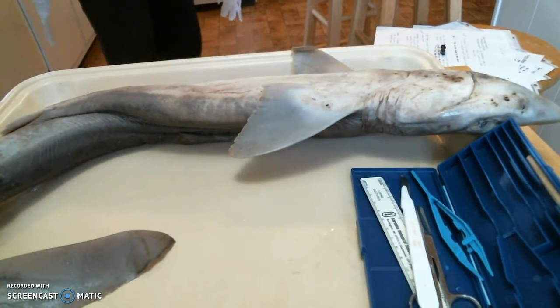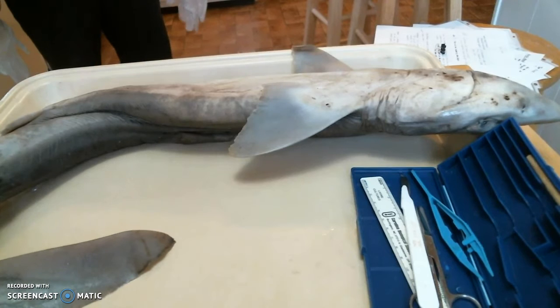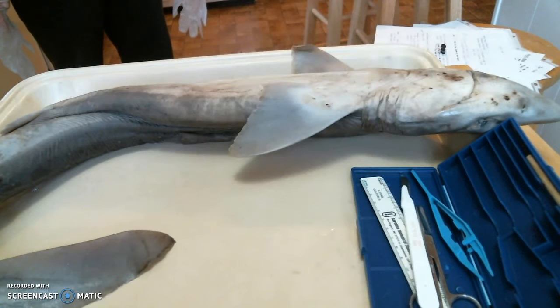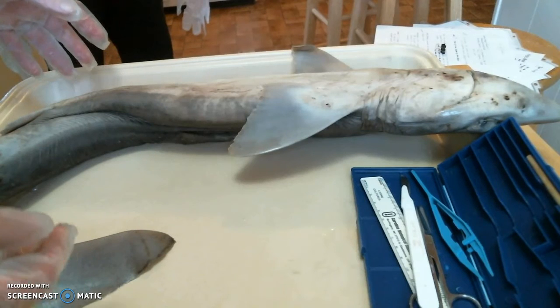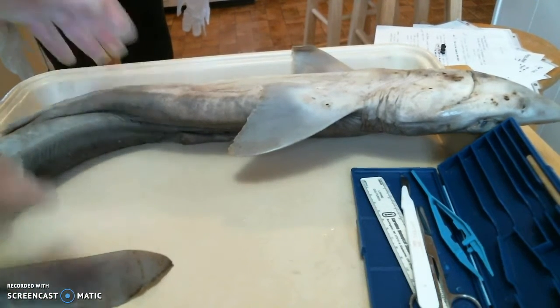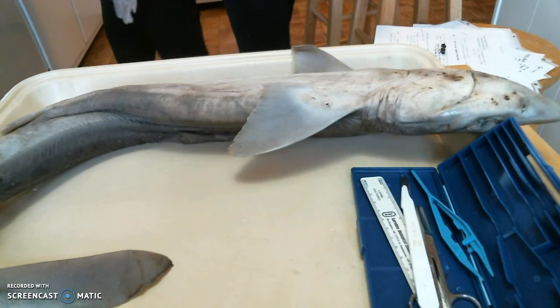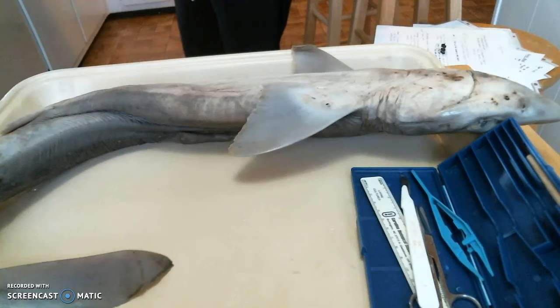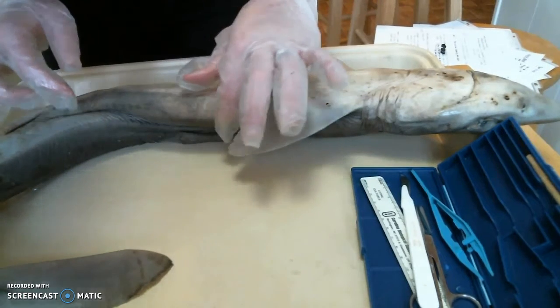Alright, so we took it outside, we washed it off, and now we are going to go ahead and start. I know the beginning of the instructions say to have the students examine all the different fins. So if I go through my list here, it says to point out the cranium, the trunk, and the caudal fin, to have them run their hands over the skin.